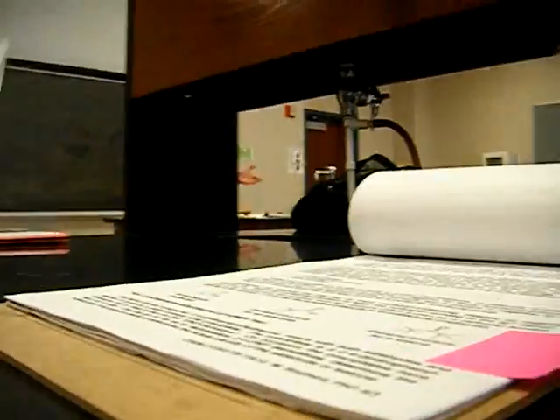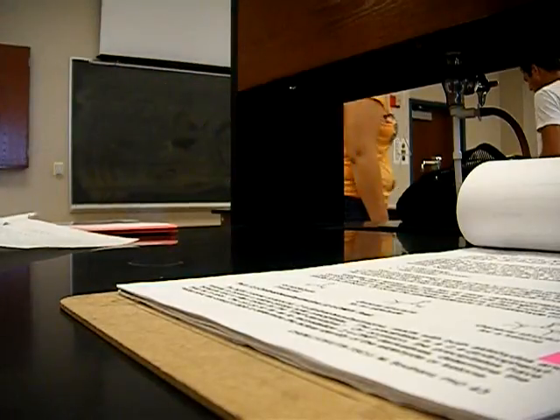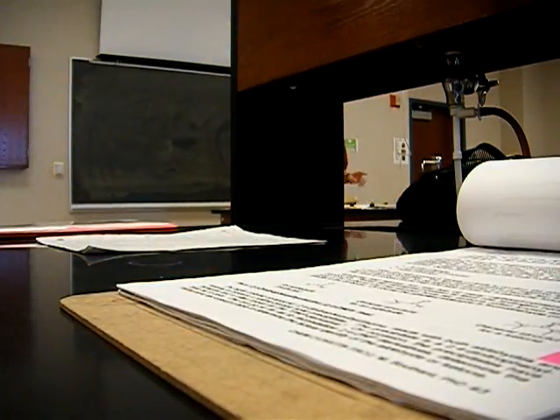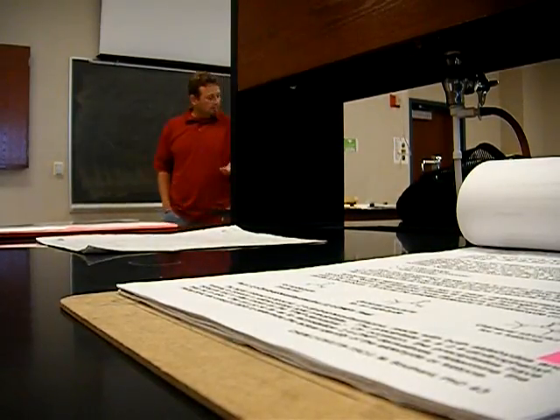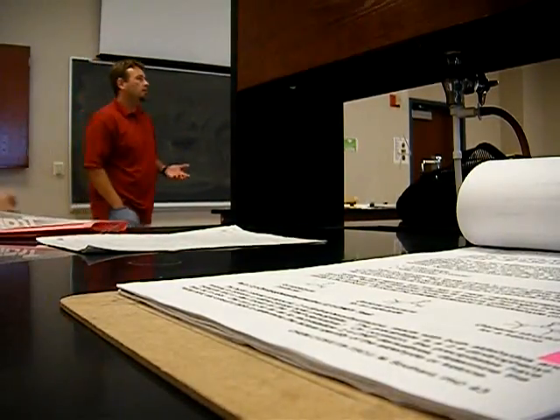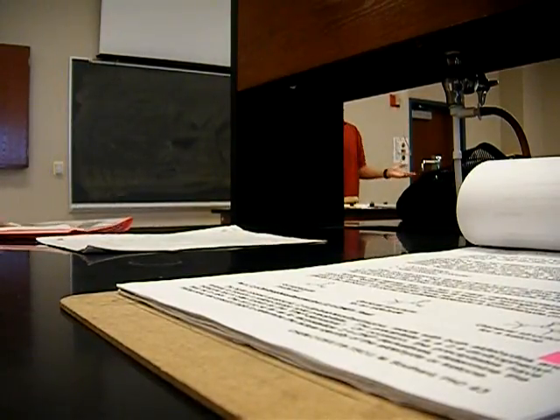There's silver ions being converted to silver metal that's coating the inside of that test tube. Okay, and that's a test for aldehydes. All right. The last one is the iodoform test. This one tests for methyl ketones or secondary alcohols. Okay, so you should have a good idea of what should react with what.